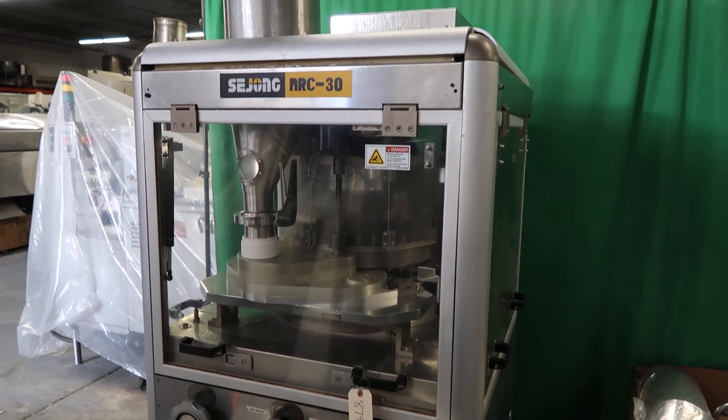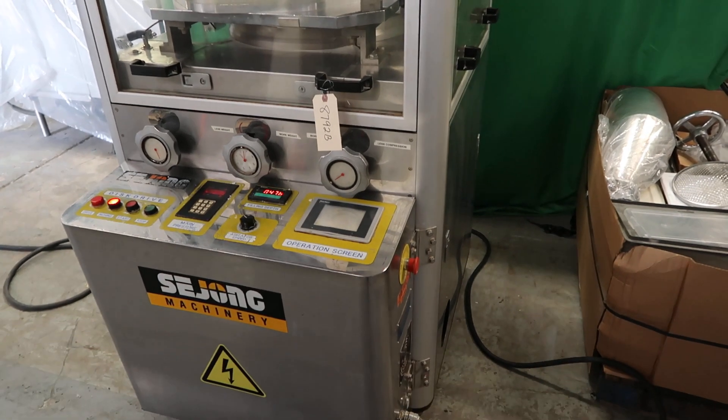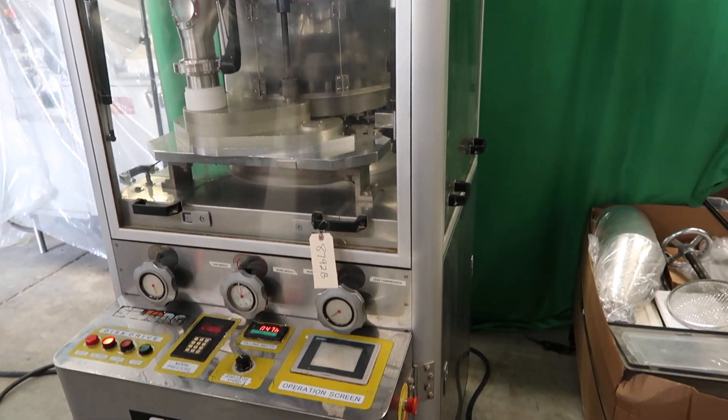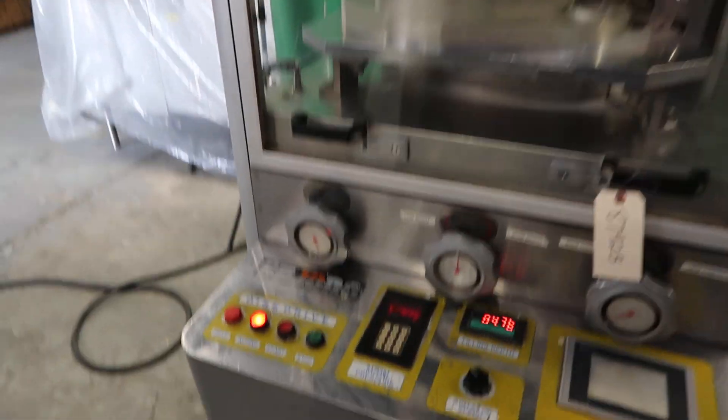This is the Seijon 30 station pre-compression rotary tablet press with detooling. Stock number 8792B. Available at Wohl Associates.